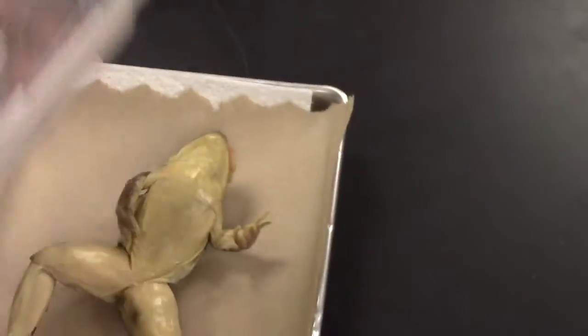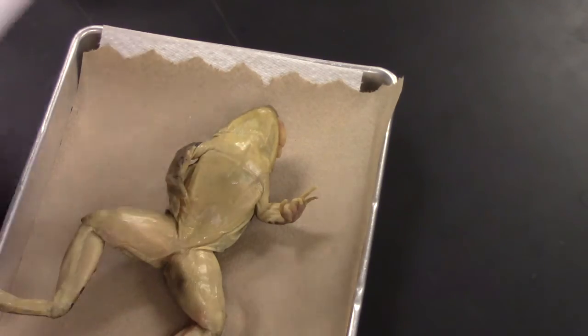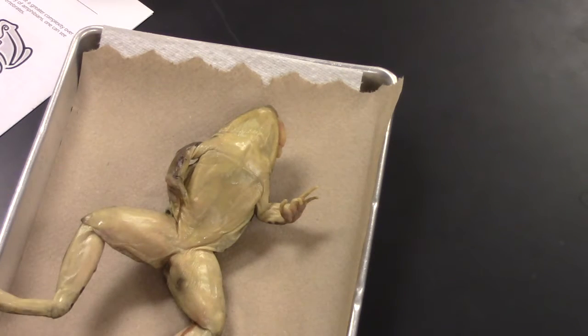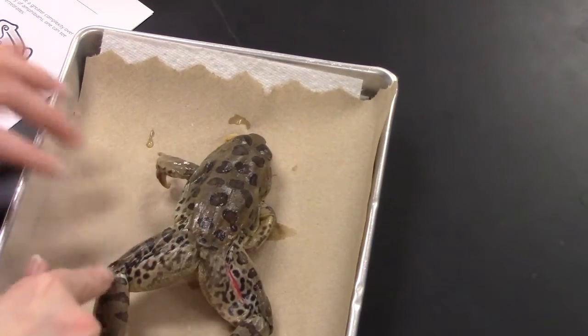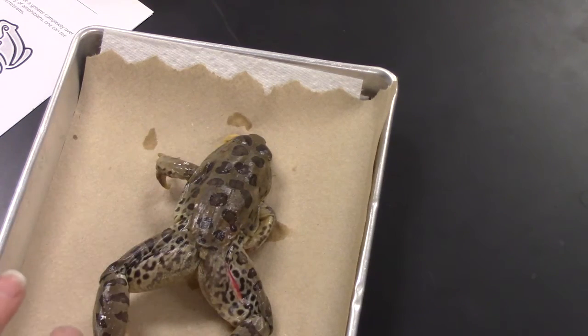Of course we have the frog. So before you get started, there is a part on external anatomy. I'm going to walk you through a couple of helpful hints and tricks of the trade before we get into the nitty-gritty. Notice the coloration — these are the chromatophore cells that give the frog its fabulous coloring.